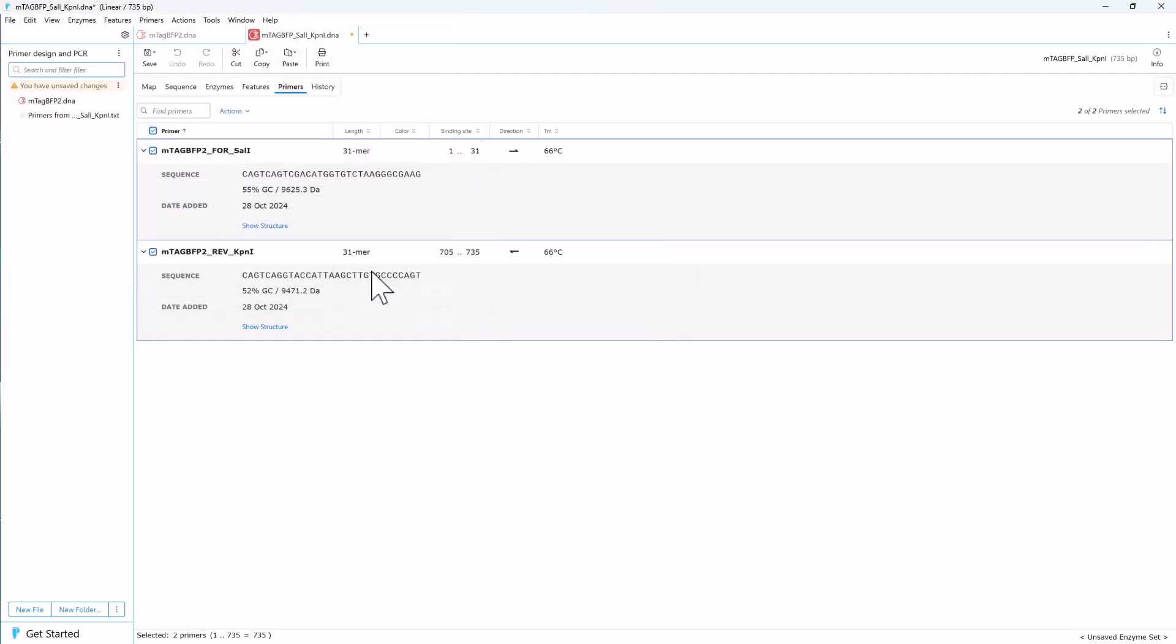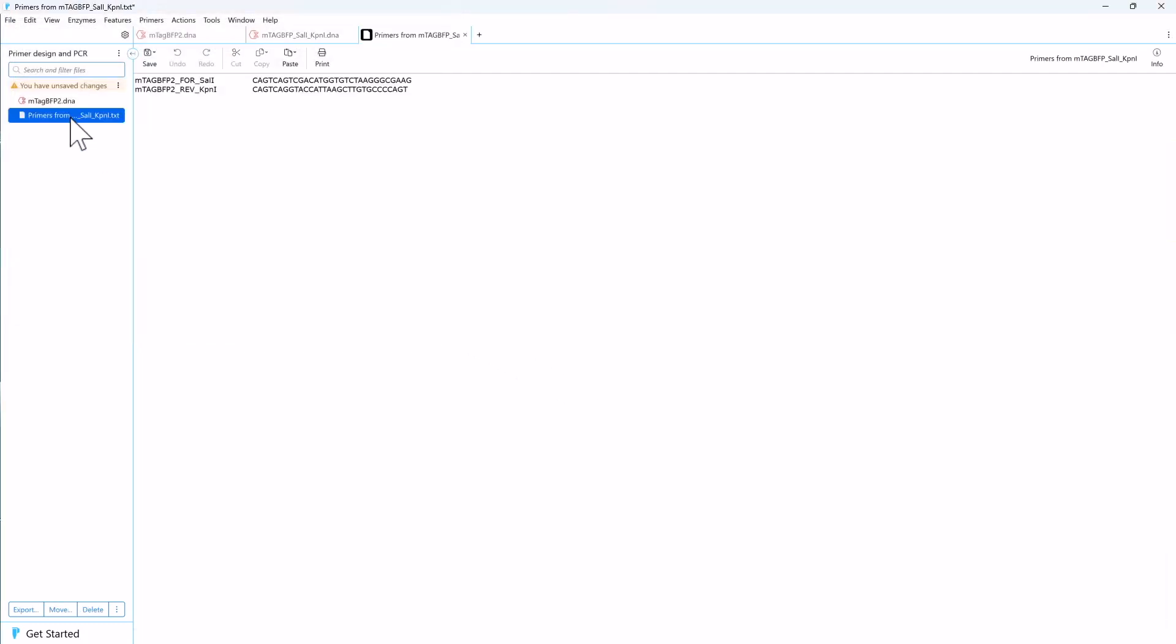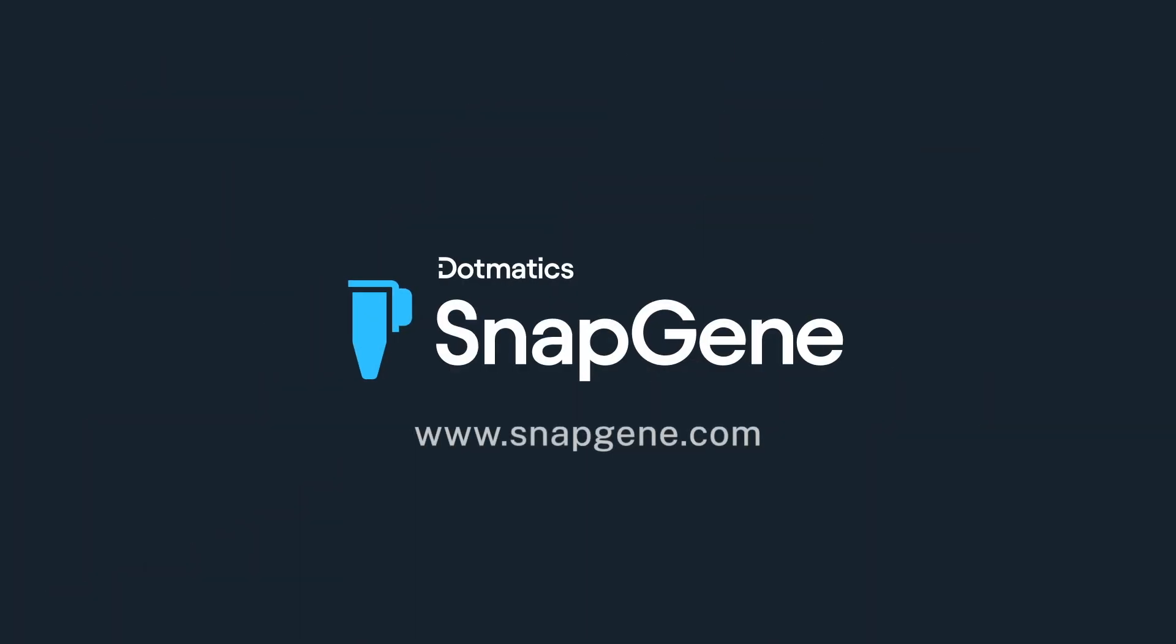And that's how you can create primers and simulate a PCR within SnapGene. To learn more, visit SnapGene.com.